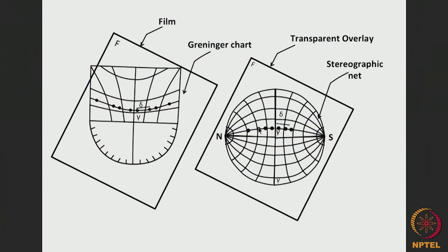So, we can measure the angle between the different poles here. If we have with us values of interplanar angles for the different planes in the cubic system, because we are working on the cubic system, then by comparing these values between the poles, it is possible to identify the planes which have given rise to those diffraction spots in the back reflection Laue method. Now, we will take up a concrete example to show how it works.